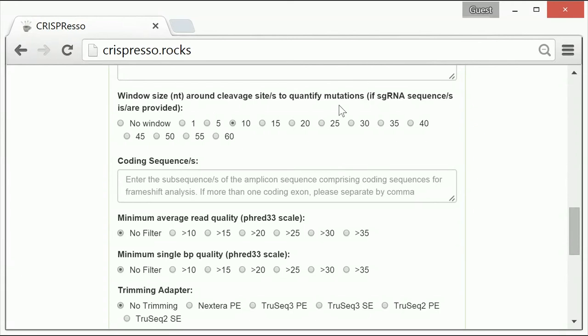Therefore, you can choose to create a window around the predicted double strand break site of the nuclease used in the experiment. This can help limit non-editing based alterations in an individual read from being inappropriately quantified in CRISPResso's analysis.